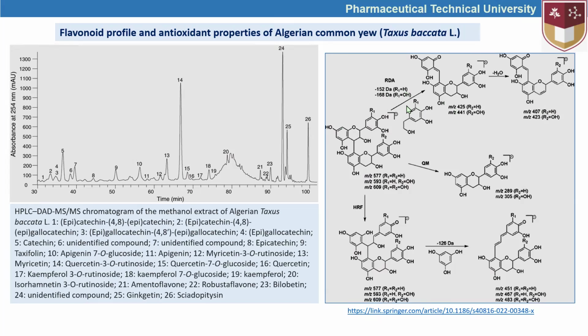The subtraction of this group of atoms leads to the formation of this molecular ion from this one. So from this ion, we can see that the authors were claiming the formation of these two ions as well.